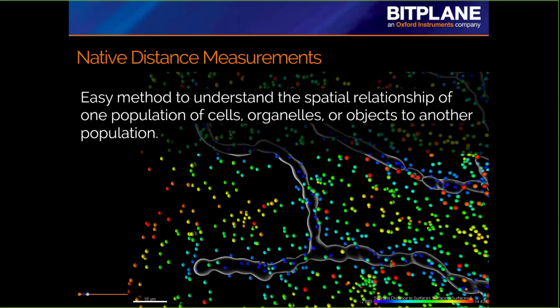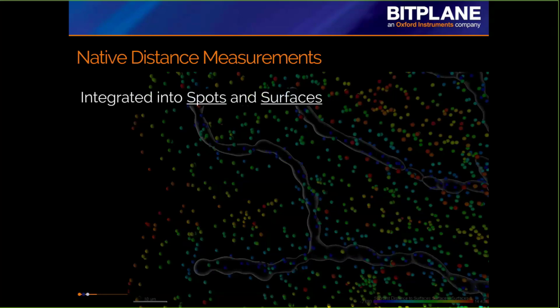It also allows us to benefit from the work we've done in the last 2 years, not only to improve batch, which was this past release in the spring, but also the work we did to improve the analysis of large images with both surfaces and spots. You will see benefits there as well because of how we innovated and implemented this work within the creation wizards.